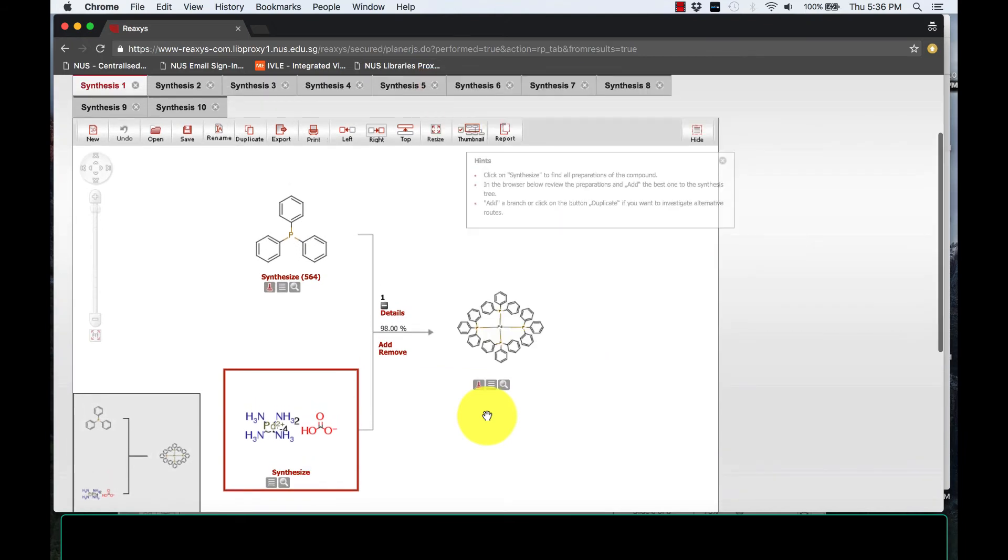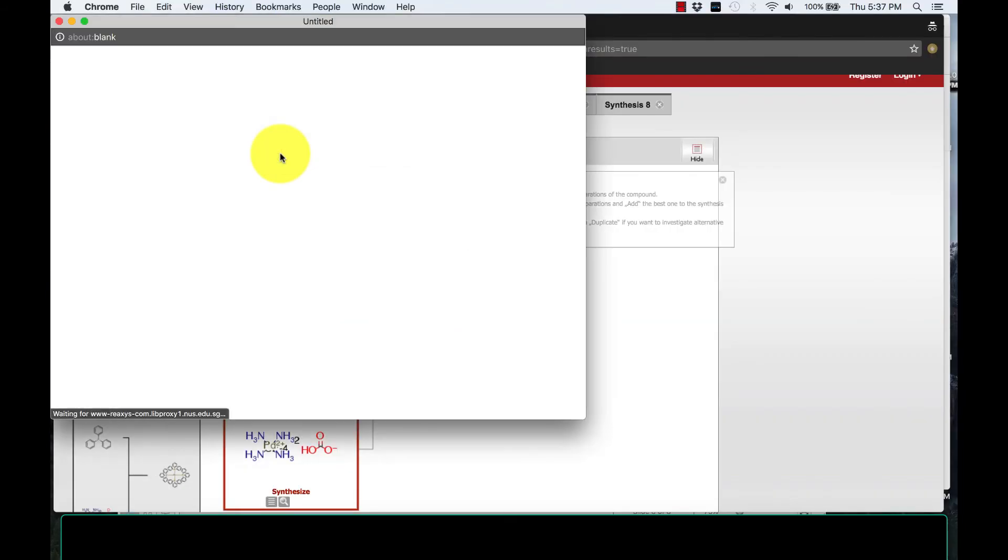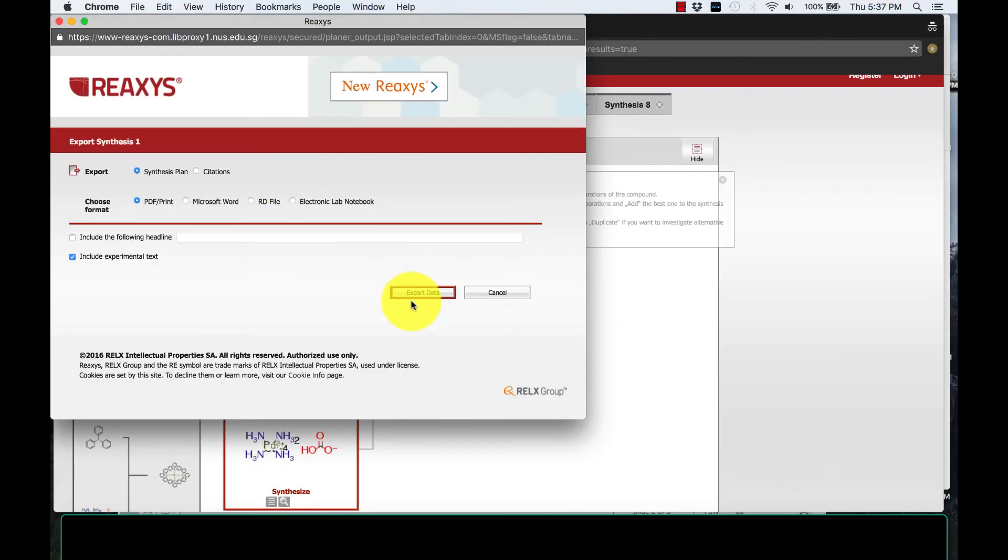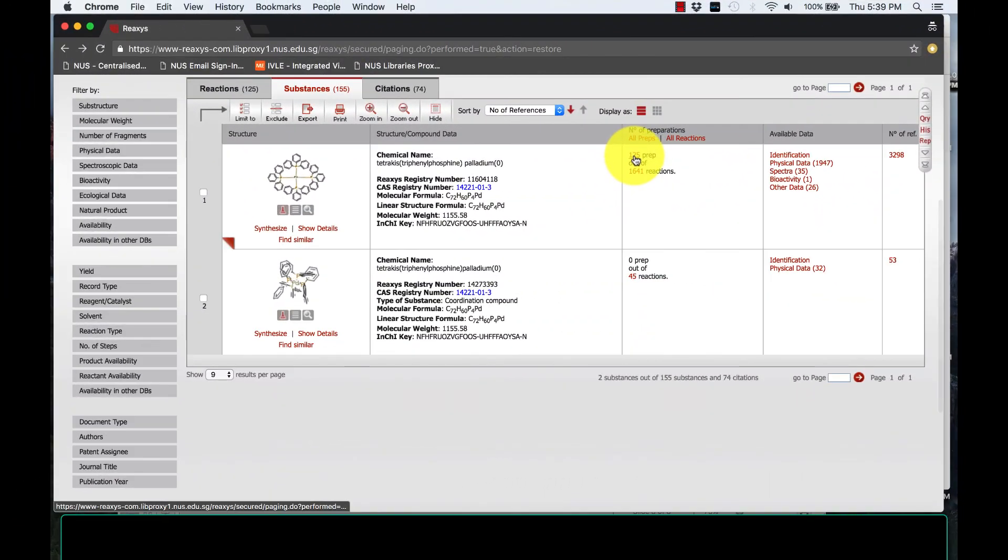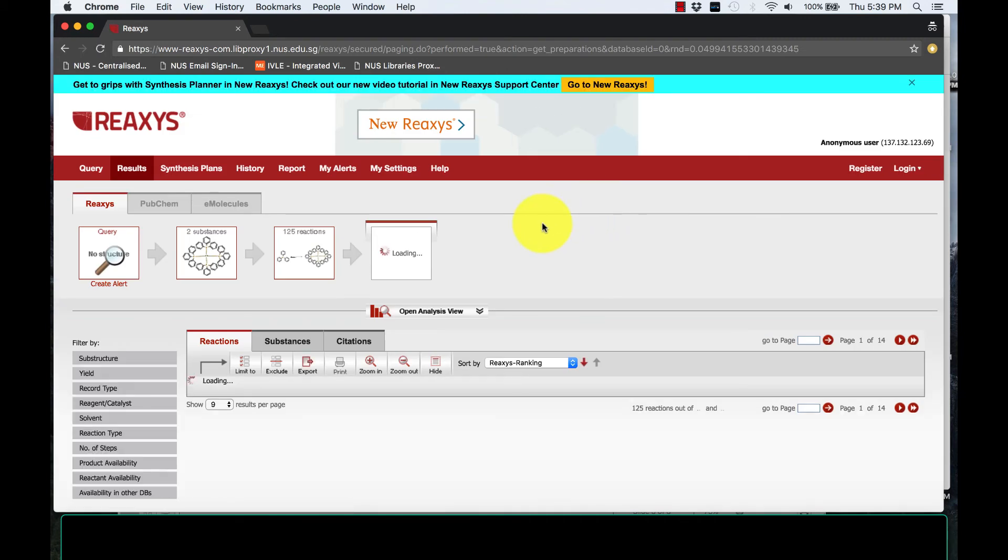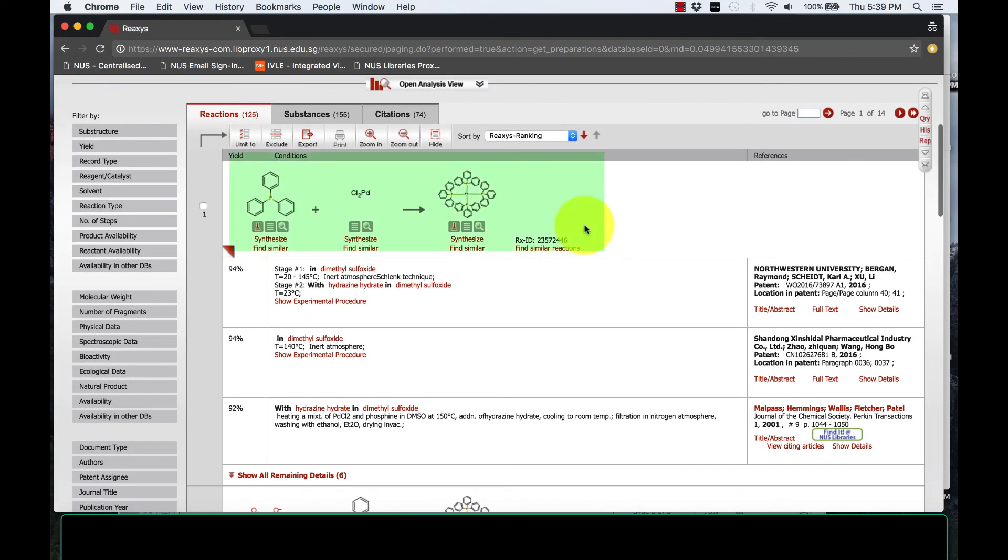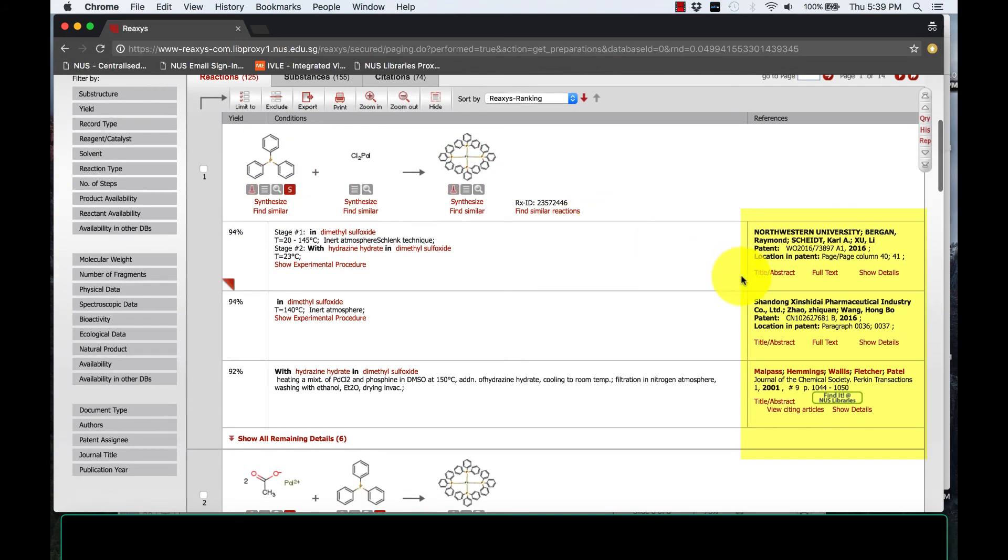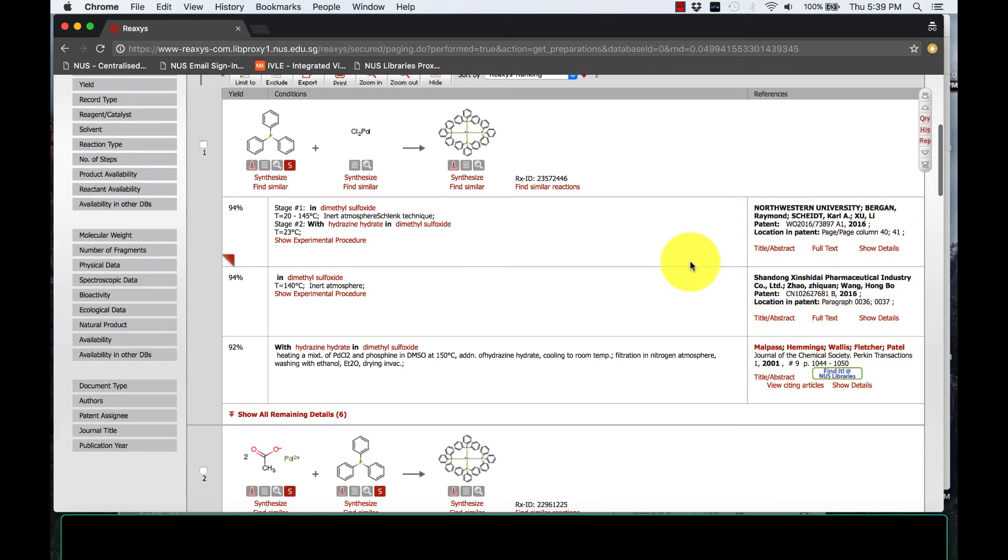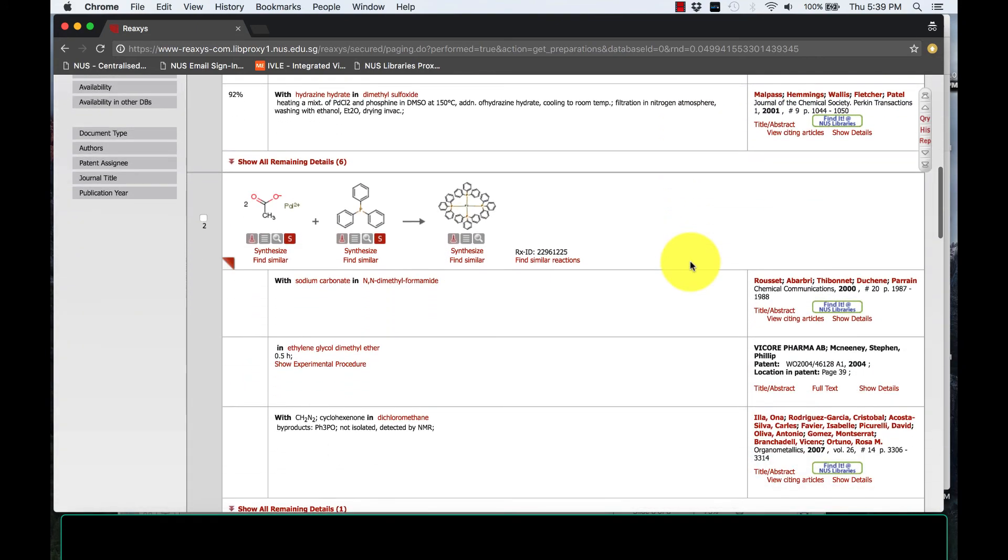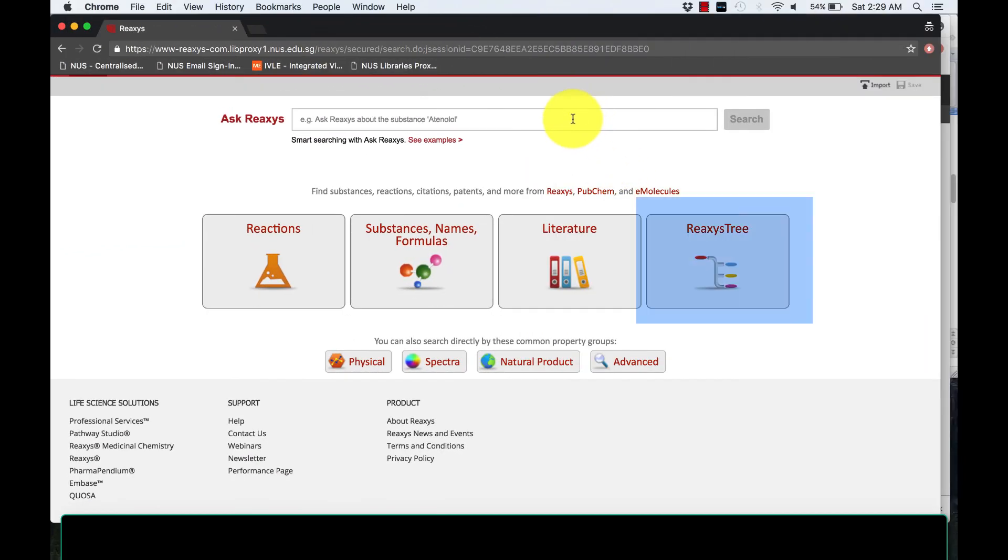Once you are satisfied with your synthesis tree diagram, you may export it for your assignments. You may also find this in future papers and read further about the synthesis reaction. Here you have the synthesis equation and on your right, you will see the papers produced by various universities and industries. Pick any, up to your own discretion. Now try the REAXIS tree.